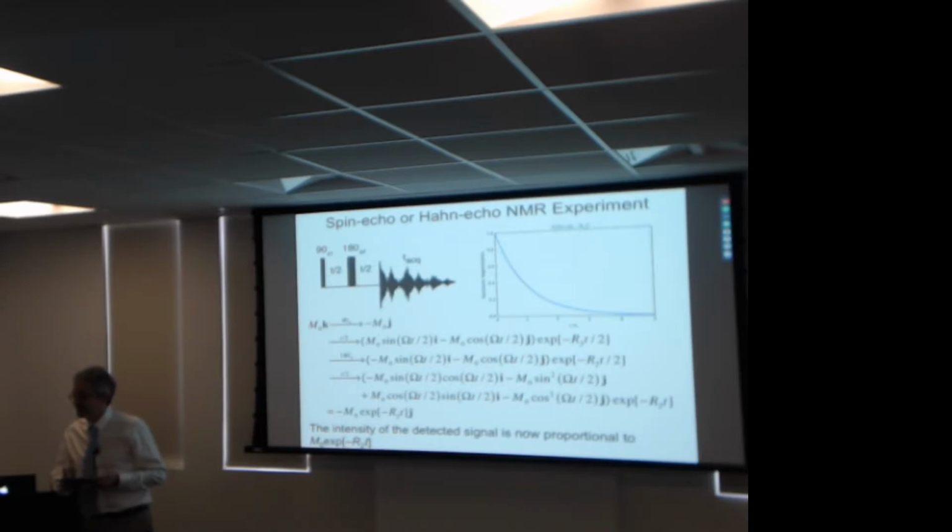And in solution, the spin echo underlies 75% of what one does for playing these kinds of tricks. You'll eventually see that many, many complicated solution experiments are just combinations of spin echoes pasted together in various ways. It gets to be a little more complicated in the other 25%, and generally more complicated in solids, but the idea is always the same.